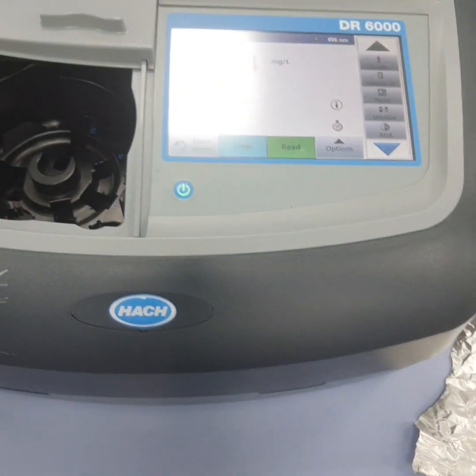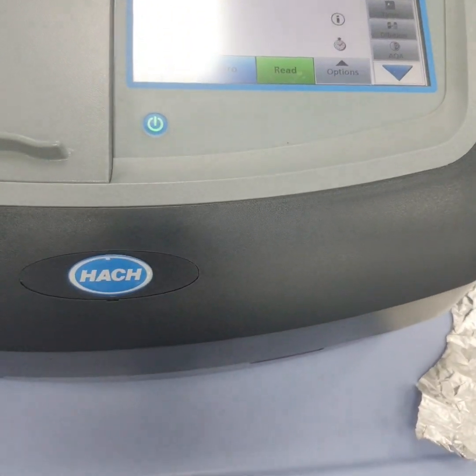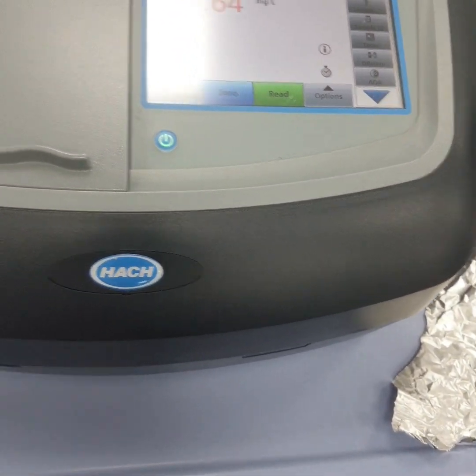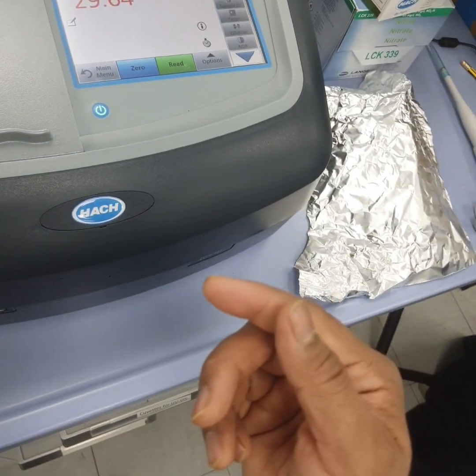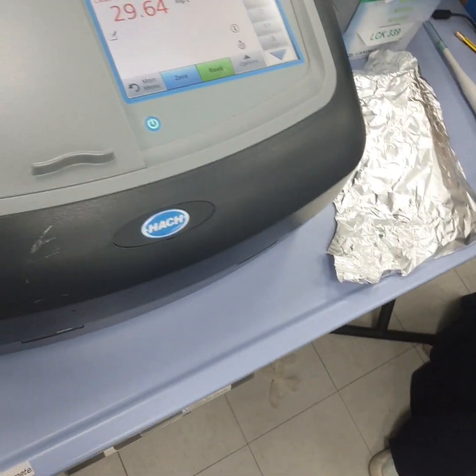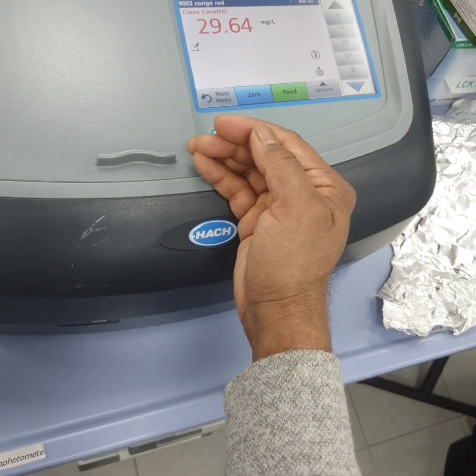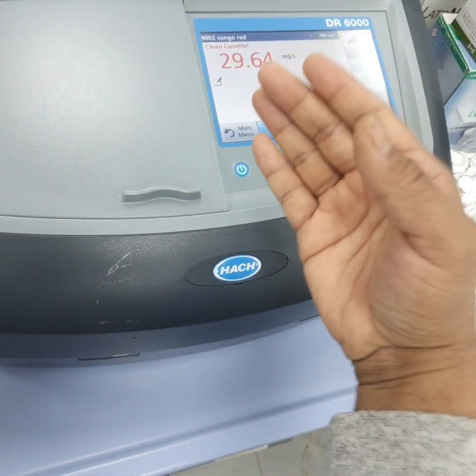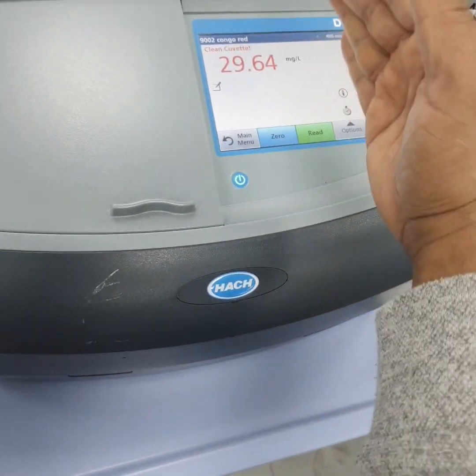Now there is one more question to all of you. Suppose we went in the calibration till 30. If you have 100, or 200, what will you do in that case? Because your machine will not read that. It will show absorbance value greater than the limit. So in that case, you need to dilute. Suppose you have 100 ppm. Since you are going till 30, you will dilute 3-4 times. Whatever value you have got, you need to multiply that value with the number of dilutions.